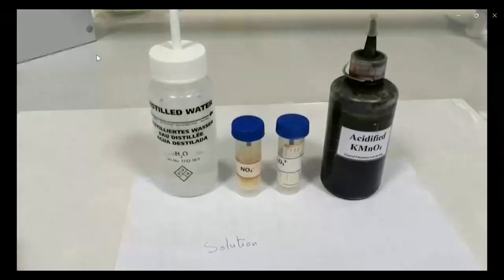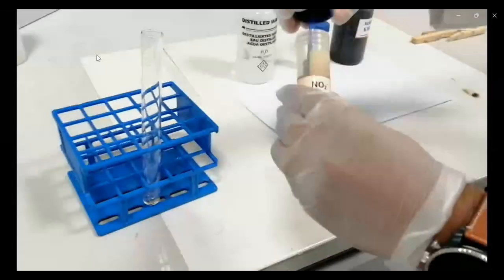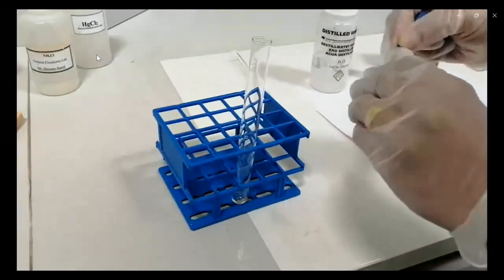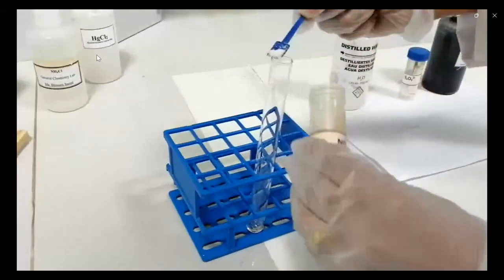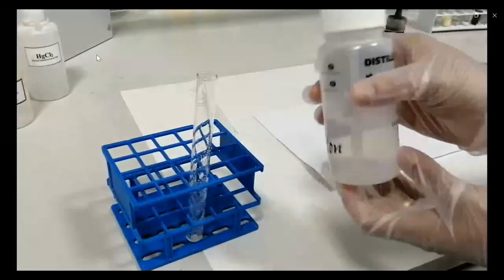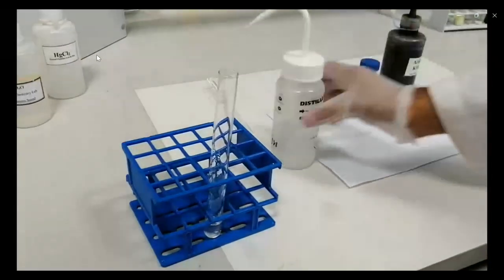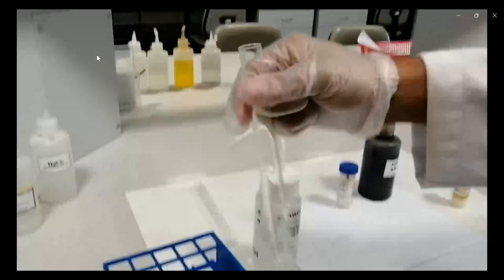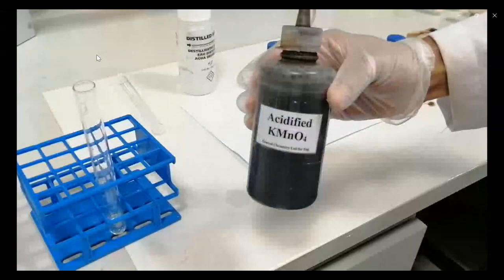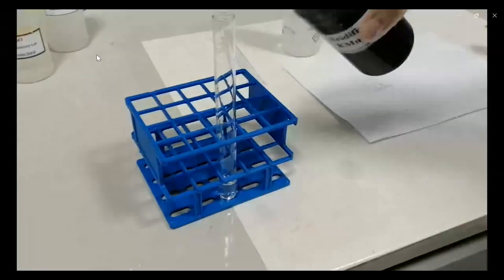The second confirmation test is a redox reaction. We're going to see the ability of reduction of these anions toward the oxidizing agent, here acidified permanganate. First, you have to prepare a solution: a few crystals plus water. Now we add acidified permanganate, which is of purple or violet color.